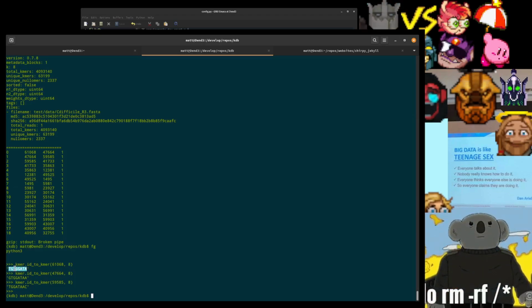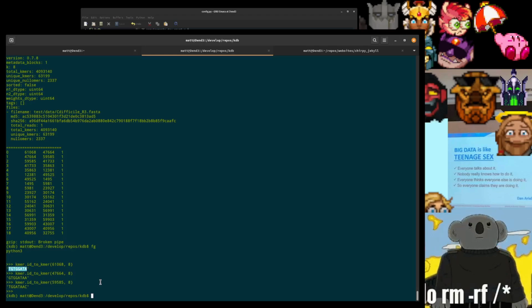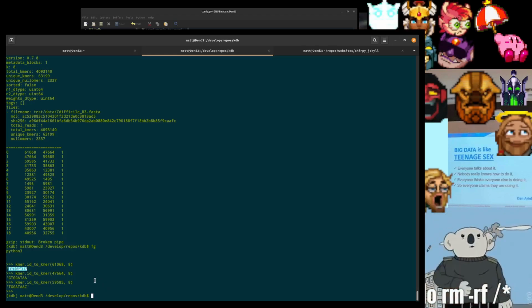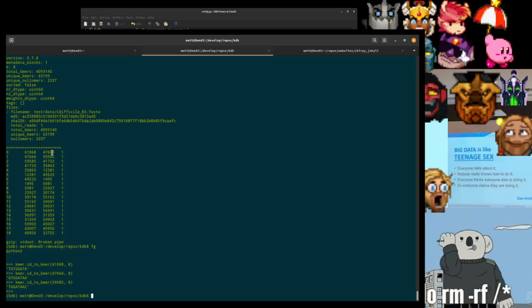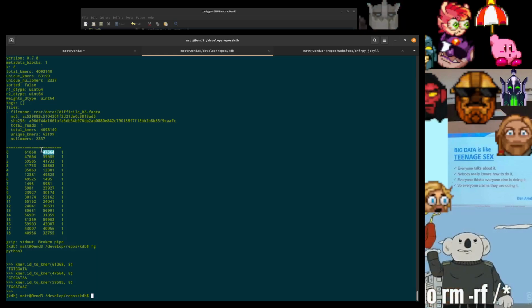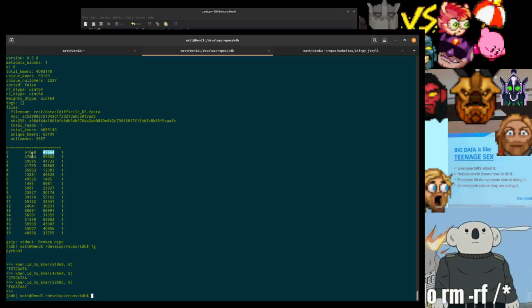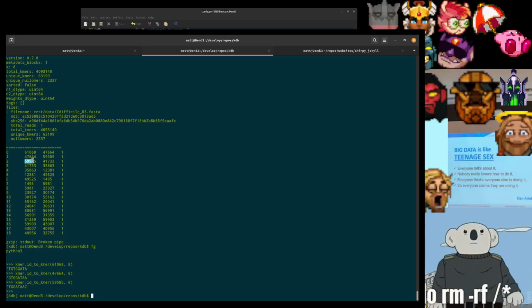In this genome, this works out to TGTGGATA. And because these two are adjacent, you'll also notice that the last node in this link is the first node of this link, and so on and so forth.